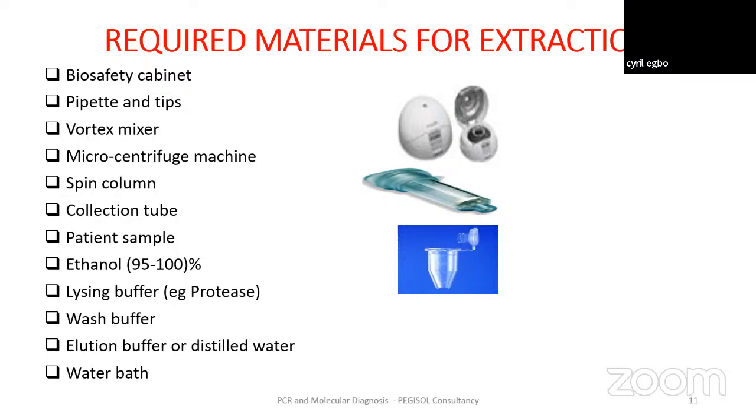A clean chain laboratory system means where you prepare and extract your DNA should be different from where you amplify and analyze your DNA samples. So this is what we call a clean chain laboratory system.